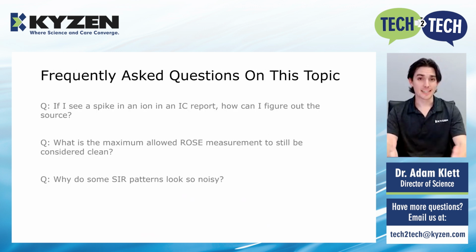All right, so now I'd like to get into some frequently asked questions. First, if I see a spike in an ion in an IC report, how can I figure out the source? Well, this can be a tough problem to solve, especially if the problem appears to be random or arises with no apparent cause.